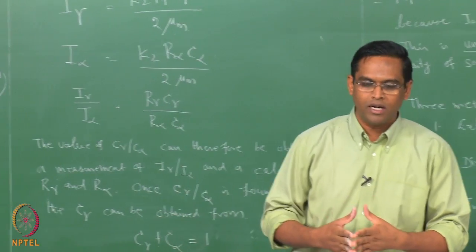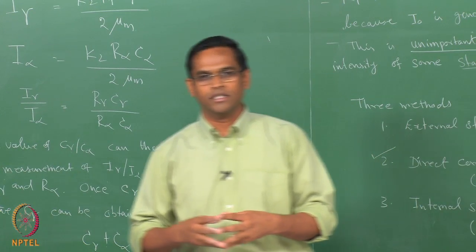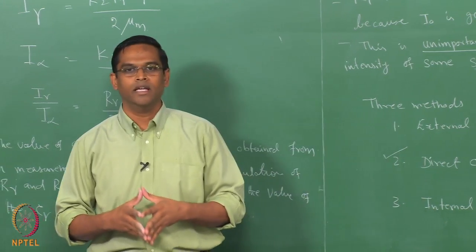Another important application is stress measurement. I will again discuss the very basic principles of stress measurement in the next class.